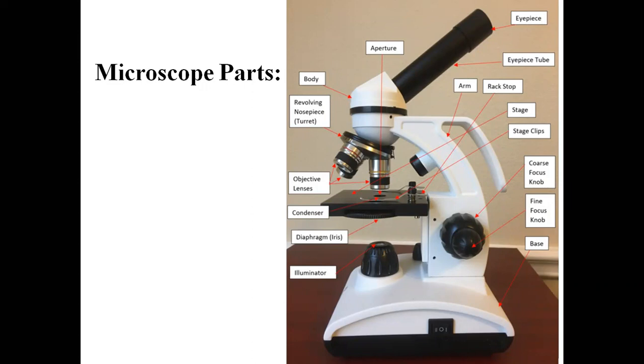There are some rotating knobs just below this stage, and with that knob you can move your stage forward, backward, left or right. That is the advantage. You don't have to touch your sample. Just fix your sample on the slide once, and with the help of the rotating knob, you can shift your stage according to your convenience.